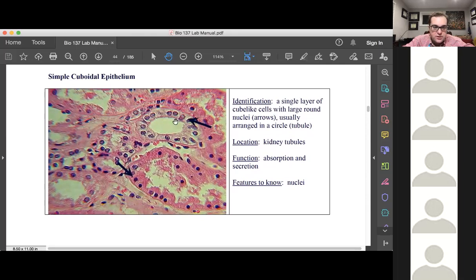This right here is called your lumen, which is pretty much the whole inside where we would have urine or blood flow. More likely it's going to be urine because it's a kidney tubule. This is the whole kidney tubule. It's not a cell, I'm sorry, it's a structure. This is how you filter your urine. This is where you would have your urine or waste product flowing through.